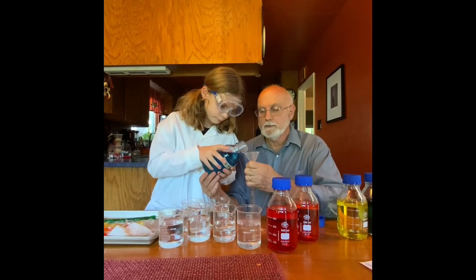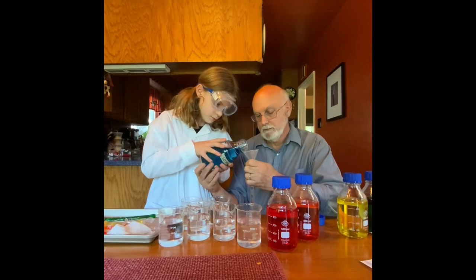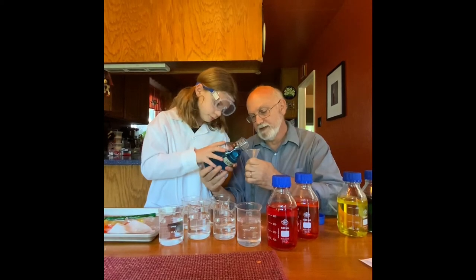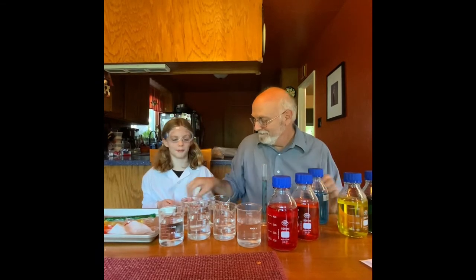So we need to put 25 mils of this in — go ahead and pour that in. Keep going, perfect. It doesn't matter if we have a little bit extra, that's quite all right. By the way, never pour stuff back into the reagent bottle.